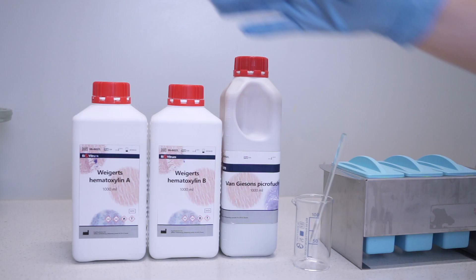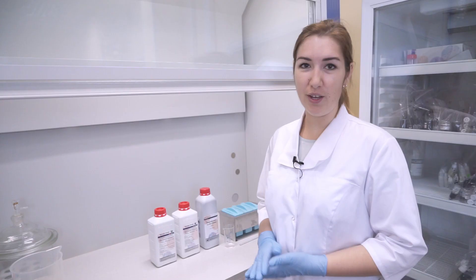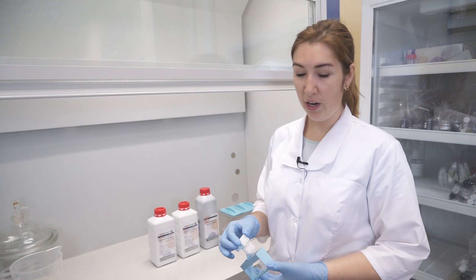To stain slides with the Van Gieson method, we will need Weigert's hematoxylin, which we will prepare as a mixture of solutions A and B right before staining, and a mixture of picric acid and acid fuchsin.